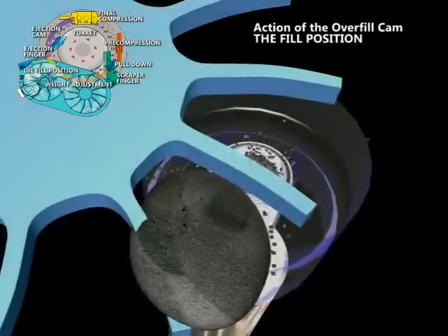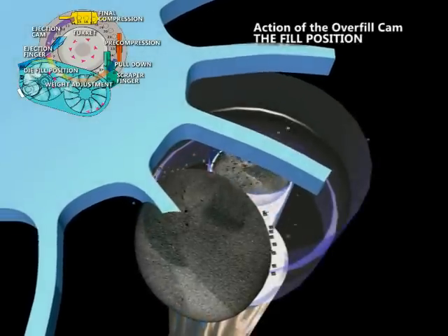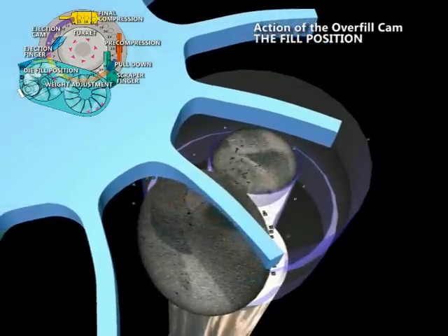At the fill position, the lower punch is pulled down by the fill cam as the die is passing under the feed frame. The product enters the die bore by gravity.